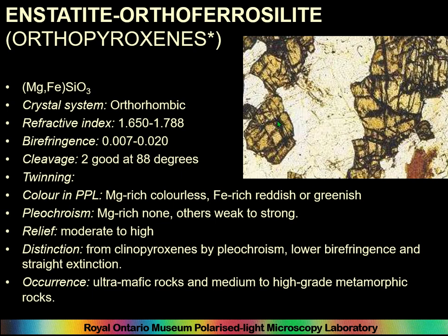So okay, I'm looking for a high relief mineral. This is a high relief mineral. The birefringence, therefore, in relation to the glue, is actually not that great. And so it doesn't have all these crazy colors like here. It's usually around here somewhere. This is actually plain polarized light, so you're not going to see them anyway.